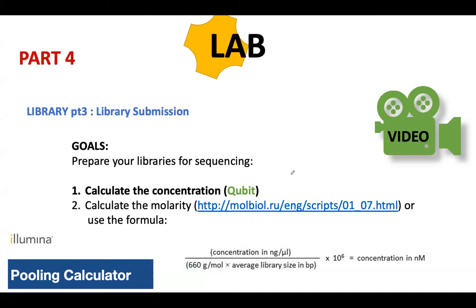In general, the qPCR is actually more accurate than the Qubit because it's measuring only the amplifiable DNA. But if you have a good library, most of the time the Qubit and the qPCR are quite similar. Okay, so you can use either one.